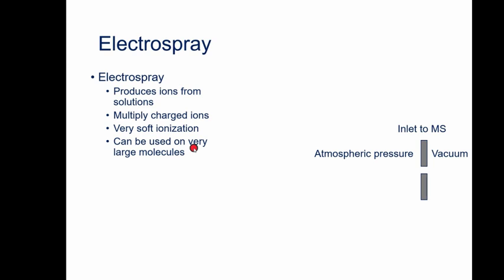That we've successfully shown. And it's what we would class as an ambient ionization technique. It's not traditionally included in the list of ambient ionization techniques, but it still happens at atmospheric pressure outside the mass spectrometer. So in a traditional setup, like you'll see in the image here, we've got an atmospheric pressure region outside the mass spectrometer. This is the lab. Then you've got some metal barrier with a hole in it, and behind that you've got the beginnings of the vacuum stages of the mass spectrometer.